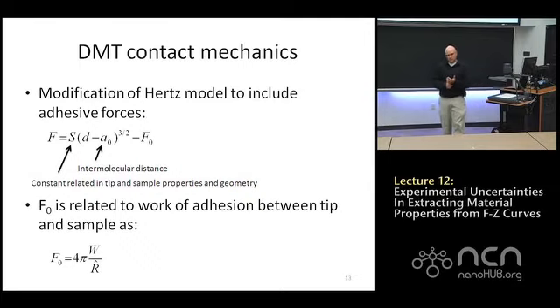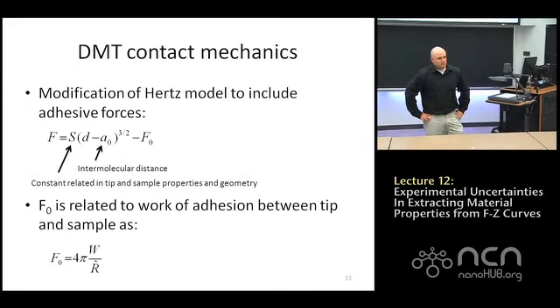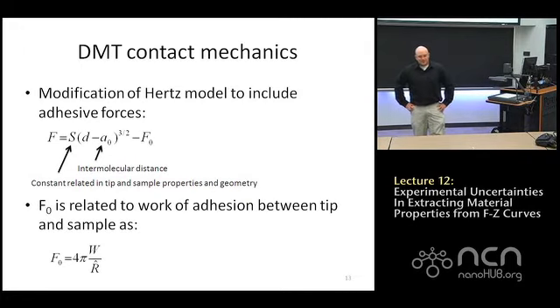So you're measuring the mechanical properties using a model. It's not like a typical test where I take the slope of the curve and find the Young modulus. You're using a mathematical model to get the material property. It will depend on the model. Right, but I will point out that saying your slope is linear in a stress-strain curve is also a model. It's just a much, much simpler model.